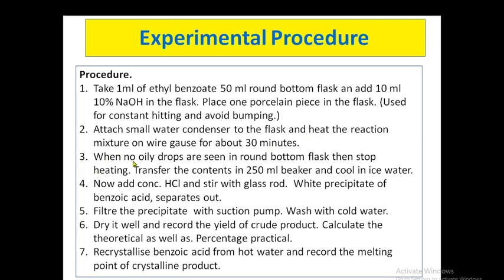After 30 minutes, when no oily droplets are seen in the round bottom flask, stop the heating and transfer all the content into a 250 ml beaker. Cool the content in ice water. Then add concentrated HCl to the solution and stir well with a glass rod — a white precipitate of benzoic acid will separate out. Filter the precipitate at the suction pump, wash with cold water, dry it well, and record the yield. Calculate both the theoretical and practical percentage yield. If you want to determine physical constants, recrystallize the benzoic acid from hot water to get pure crystals, then take the melting point of that crystalline product.